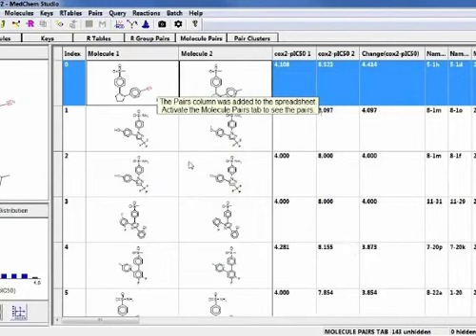So I'll click OK, and very quickly MedChem Studio compares every molecule to every other molecule in the data set, generates a maximum common substructure, and then sees what the difference is between those two compounds. If it's less than 4 atoms or mismatched atoms and bonds, then it goes on to the next step where it looks at the COX-2 IC50 data, and if the change is greater than 3, it will present it in this tab. So it's generated 143 of these pairs where the difference is very large as far as the IC50, but the structural change is very small.